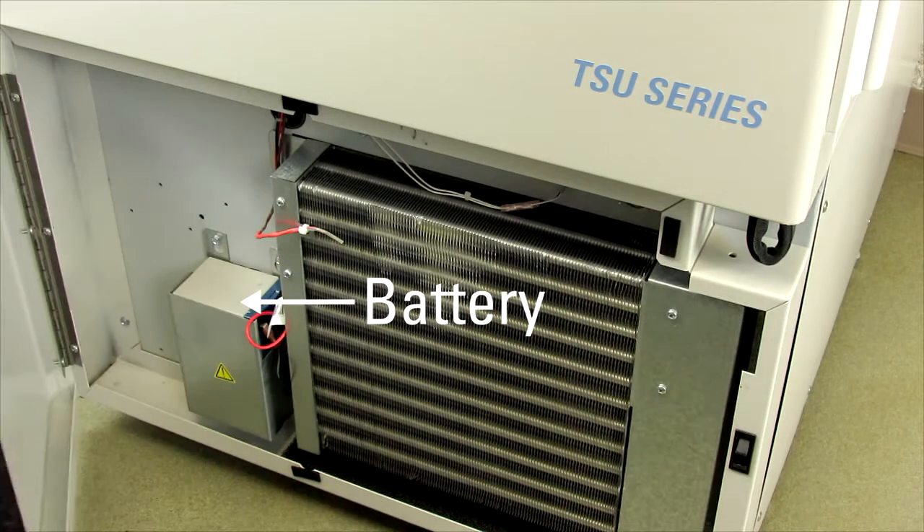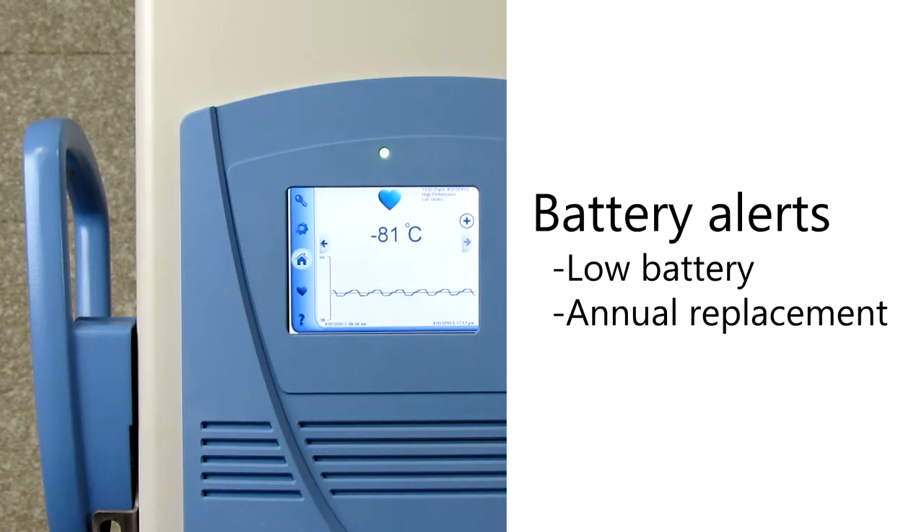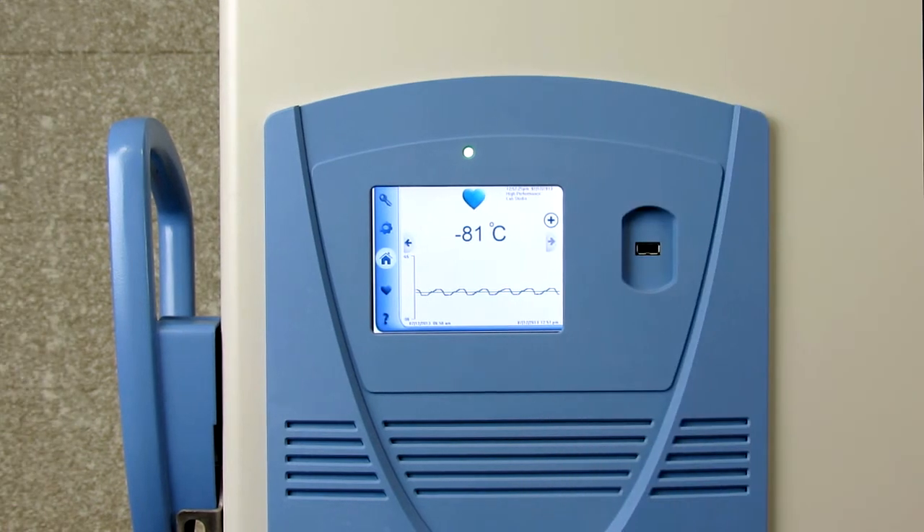Minus-80 degree freezers use batteries to power the alarms and temperature monitors during power failures and must be regularly replaced. Thermo Scientific minus-80 degree freezers with the touch screen user interface have two types of battery alerts: the low battery alarm and the annual battery replacement notification, to help you maintain backup battery power.